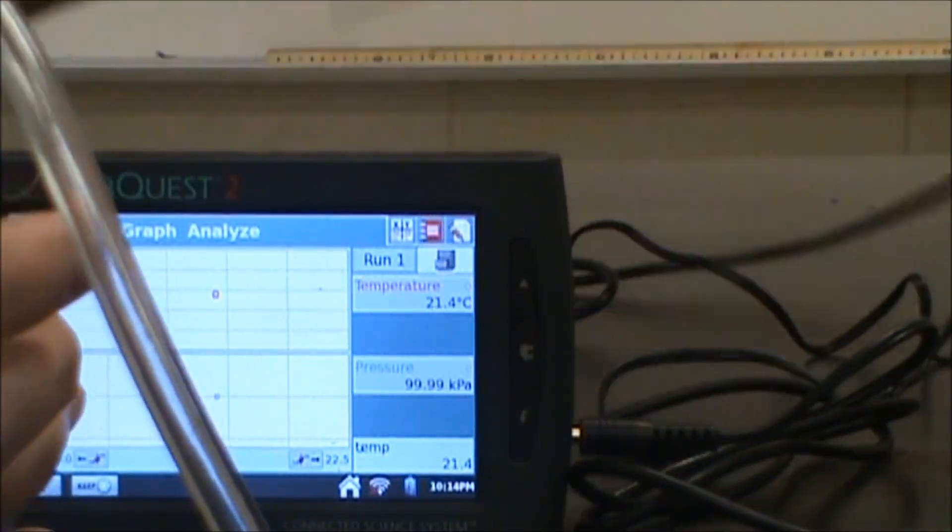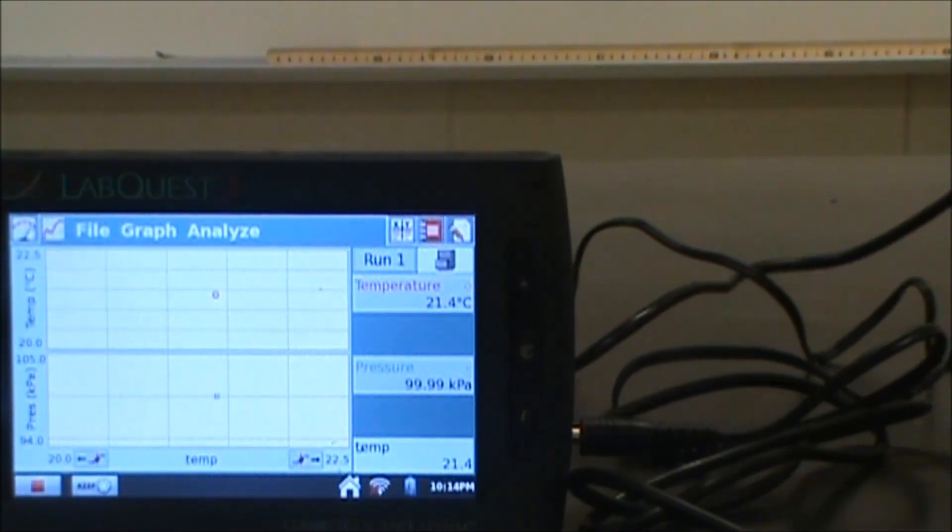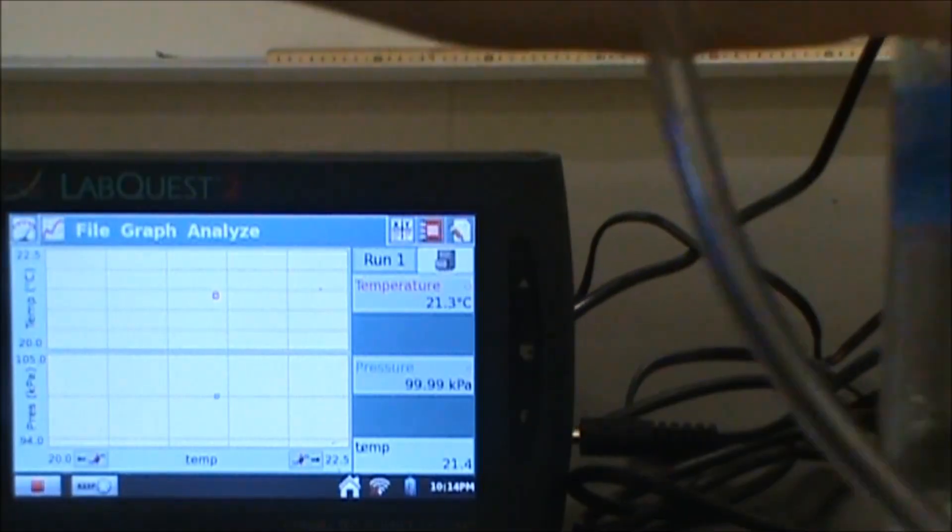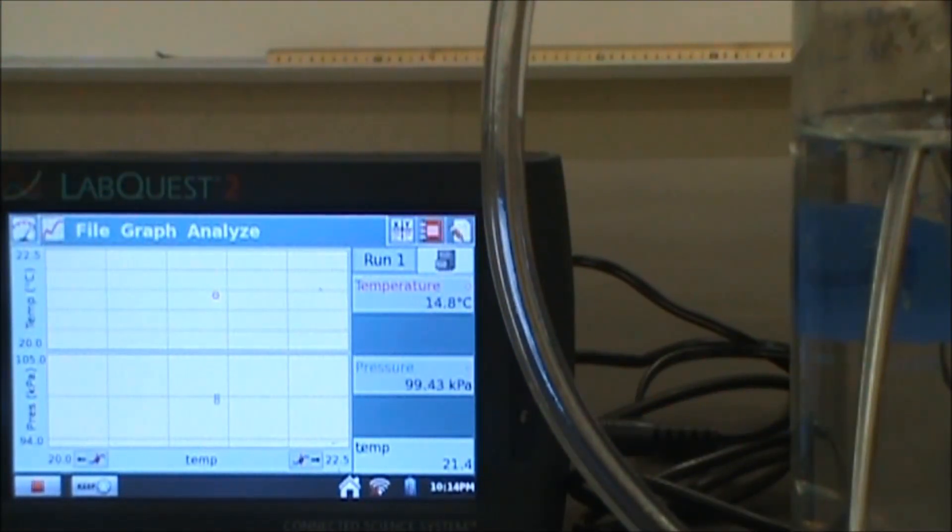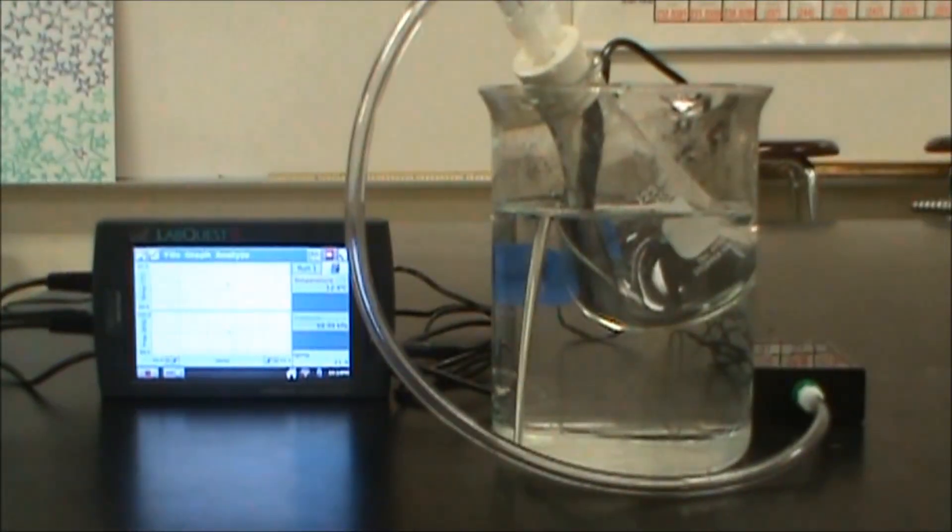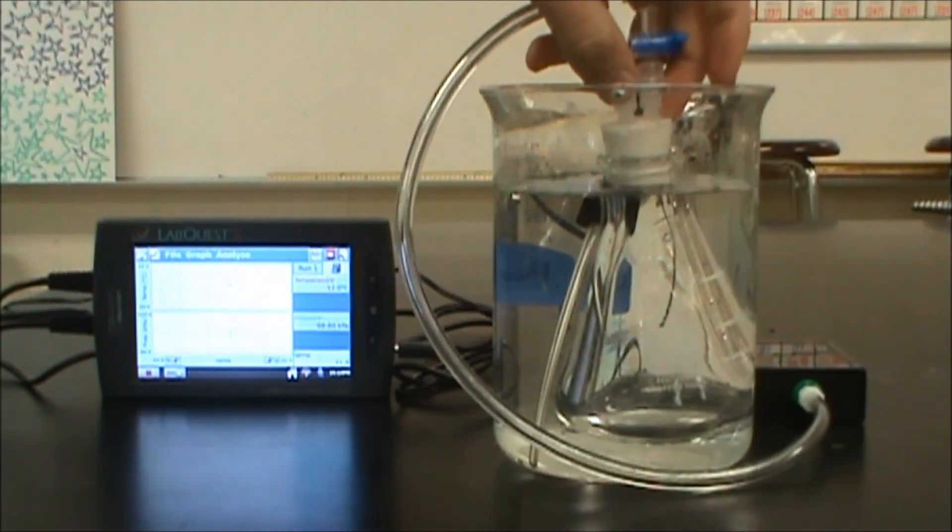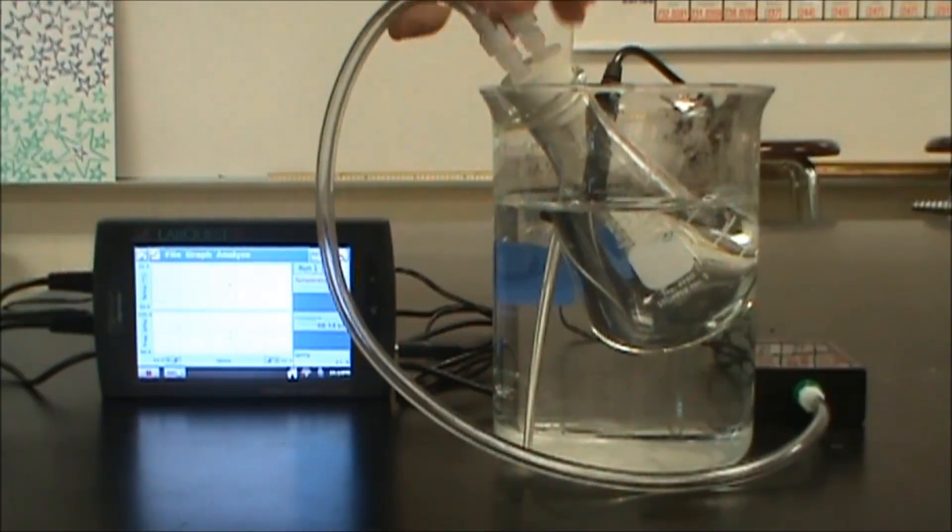What I'm going to do now is this is sealed. I'm going to take this and put these both into different environments. First, I'm going to take this over to a cold water bath and put that inside of it. Ideally you want to get this gas to be that same temperature. So you're going to let it sit for a little bit. It's going to take some time to get to that point.